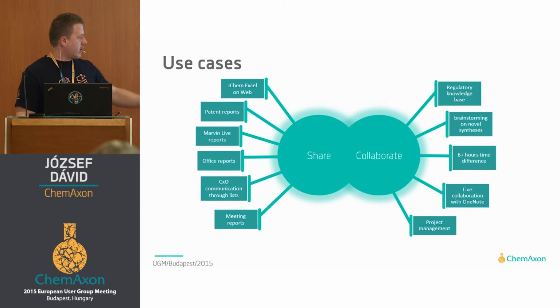And there are other use cases which we have already identified. I don't want to go into details now because I don't have time, but at the demo station we can discuss if you are interested. But the common point in all of them is the data storage, because the data is somehow stored in SharePoint or just connected to SharePoint.